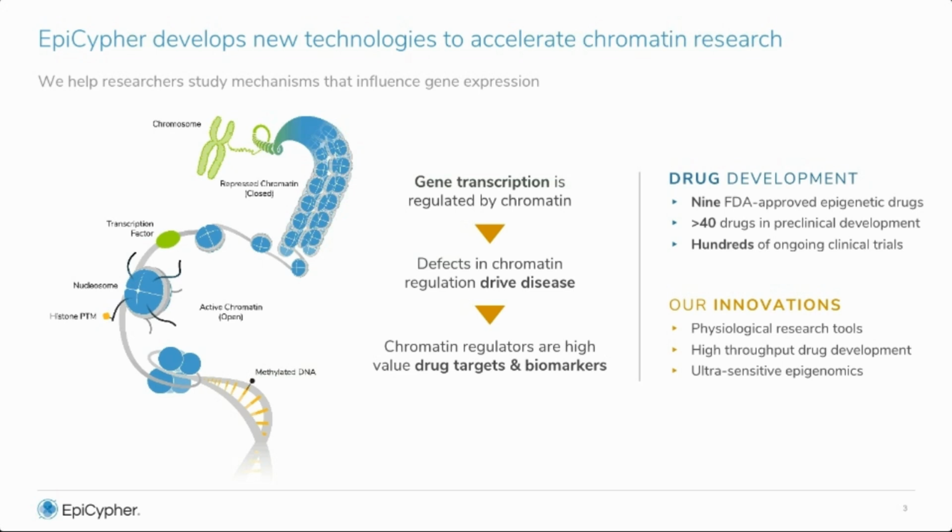And during this talk, I'll focus more on our ultrasensitive epigenomic mapping technologies and how these are enabling us to better understand not just basic gene expression changes during normal development and how these processes go awry in disease, but also how these technologies are integrating with this rapidly expanding field of therapeutic development programs that are trying to manipulate gene expression, either through small molecule inhibitors of epigenetic enzymes, transcriptional regulators, or even cell and gene therapies. We are trying to fundamentally reprogram a cell's gene expression states.